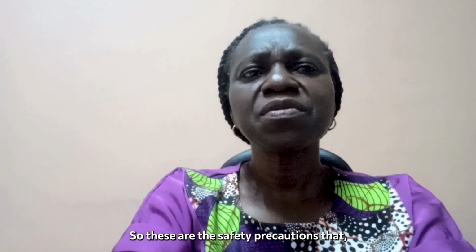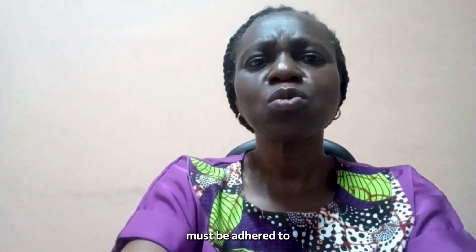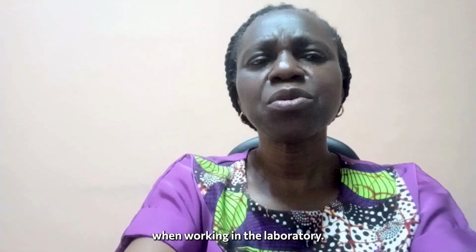So these are the safety precautions that must be adhered to when working in the laboratory.